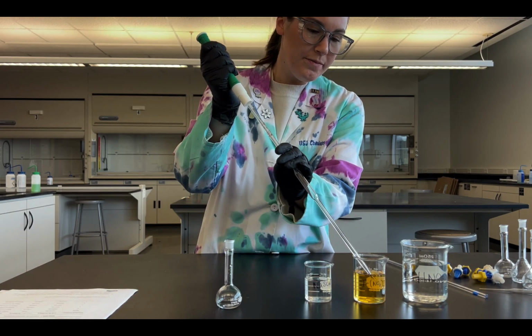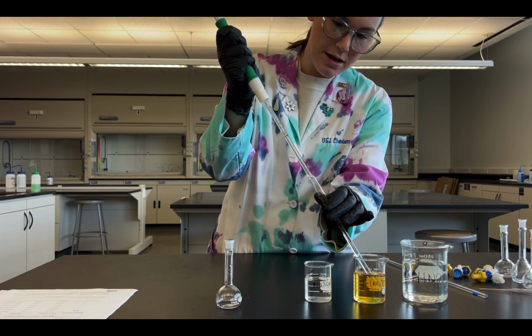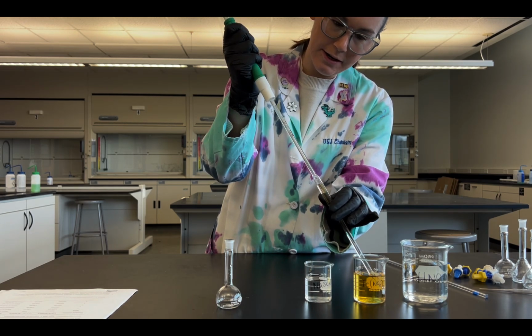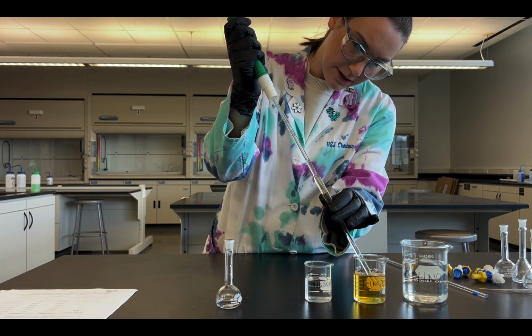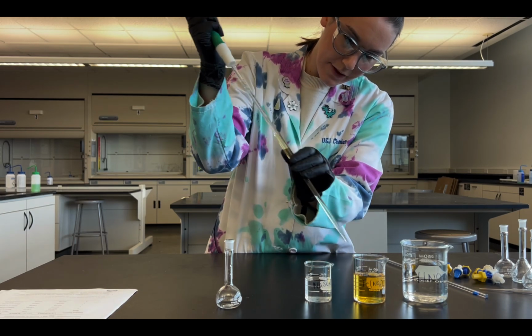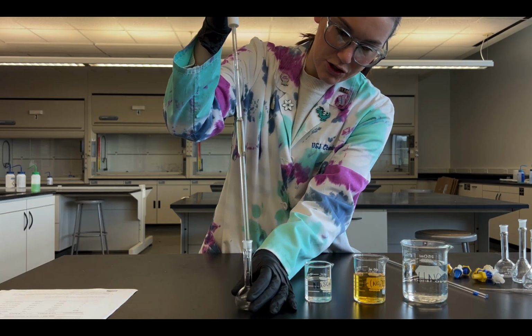So what I'm going to do is put my pipette in here, and I'm just going to pump it up till I get 5 milliliters, and I'm going to transfer that to my flask.